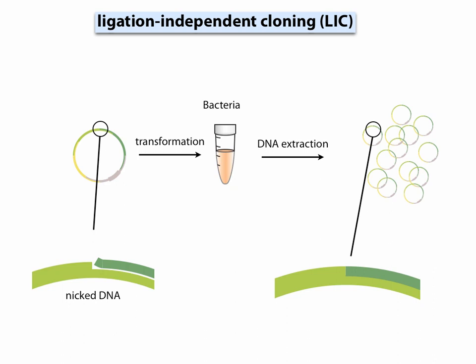Depending on the choice of the DNA overhangs, one hardly observes any shortened assembly products, and we have not experienced any wrong order assemblies. In certain cases, the LIC assembly is so specific that individual clones do not need to be singled out following the transformation reaction. This means that one can grow the bulk of transformed bacteria without any agar plate streaking.